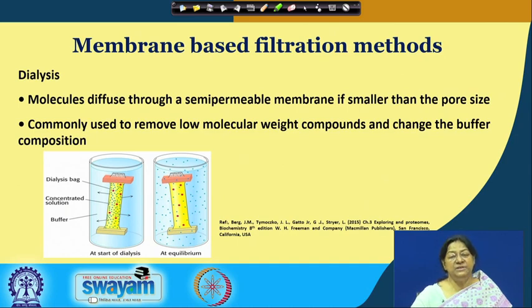In membrane based filtration methods, if we have a particular salt concentration that we have used for the separation, we have the concentrated solution with the salt and the buffer, and we want to remove any extra salt present in the system.